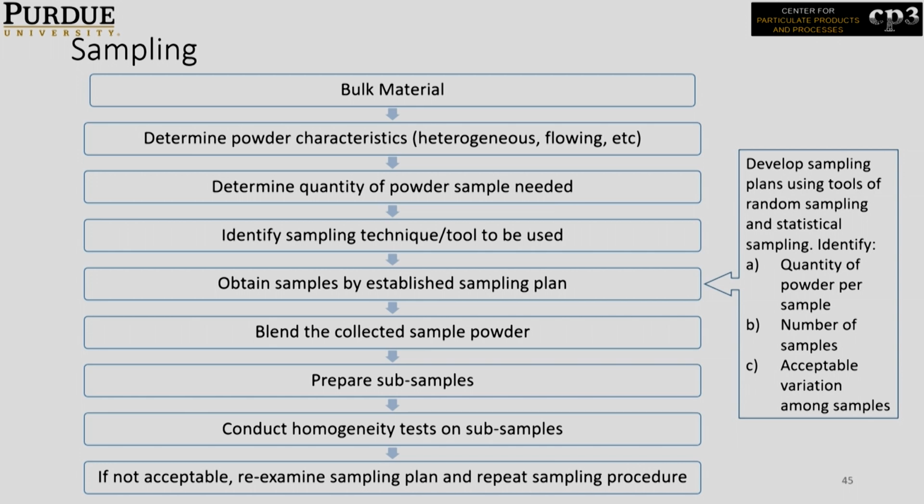And we talked about the sampling protocol, right? Initially, when you develop a sampling protocol, you should first know the characteristics of the material itself. We talked about free flowing and cohesive materials, right? So first we should know the powder characteristics. If it's very cohesive, like cake material, then you can just use a scoop for subsampling, okay, it doesn't affect your characterization much.